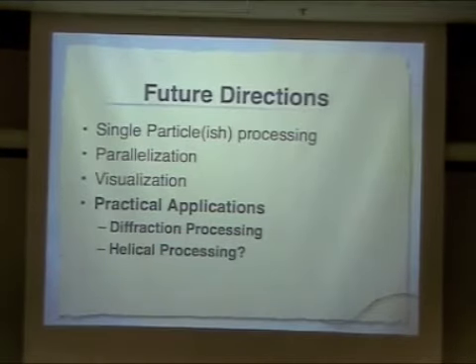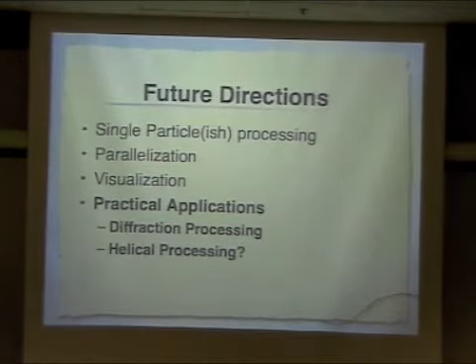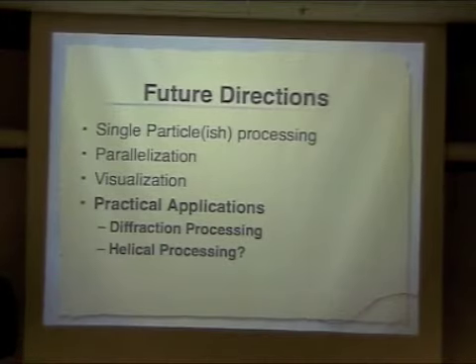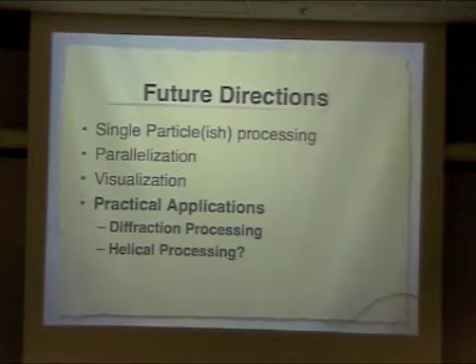Practical applications: the two biggest ones that I get asked for in 2DX are when are you going to have diffraction processing, followed immediately by when are you going to do helical processing. And the first answer is hopefully pretty soon. Diffraction processing is on our front burner. We're still thinking about how best to do that, but we're open to suggestions, and it's definitely going to happen. Helical processing, I don't know. I don't know anything about it. If there's somebody else out there who knows a lot about it and wants to collaborate, I think we'd be very happy to look into that.